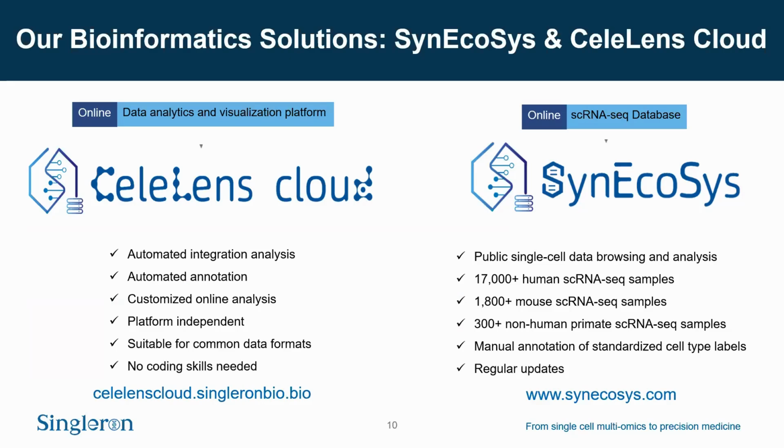Whatever technology you use, whatever data format, whatever scientific question you want to answer, CeleLens is your go-to software. The single-cell RNA database SynEcoSys is packed full with public single-cell datasets, but not just collected. The data is manually annotated in a standardized way. So SynEcoSys is the magic wand that turns the vast amounts of crude data into a usable resource.